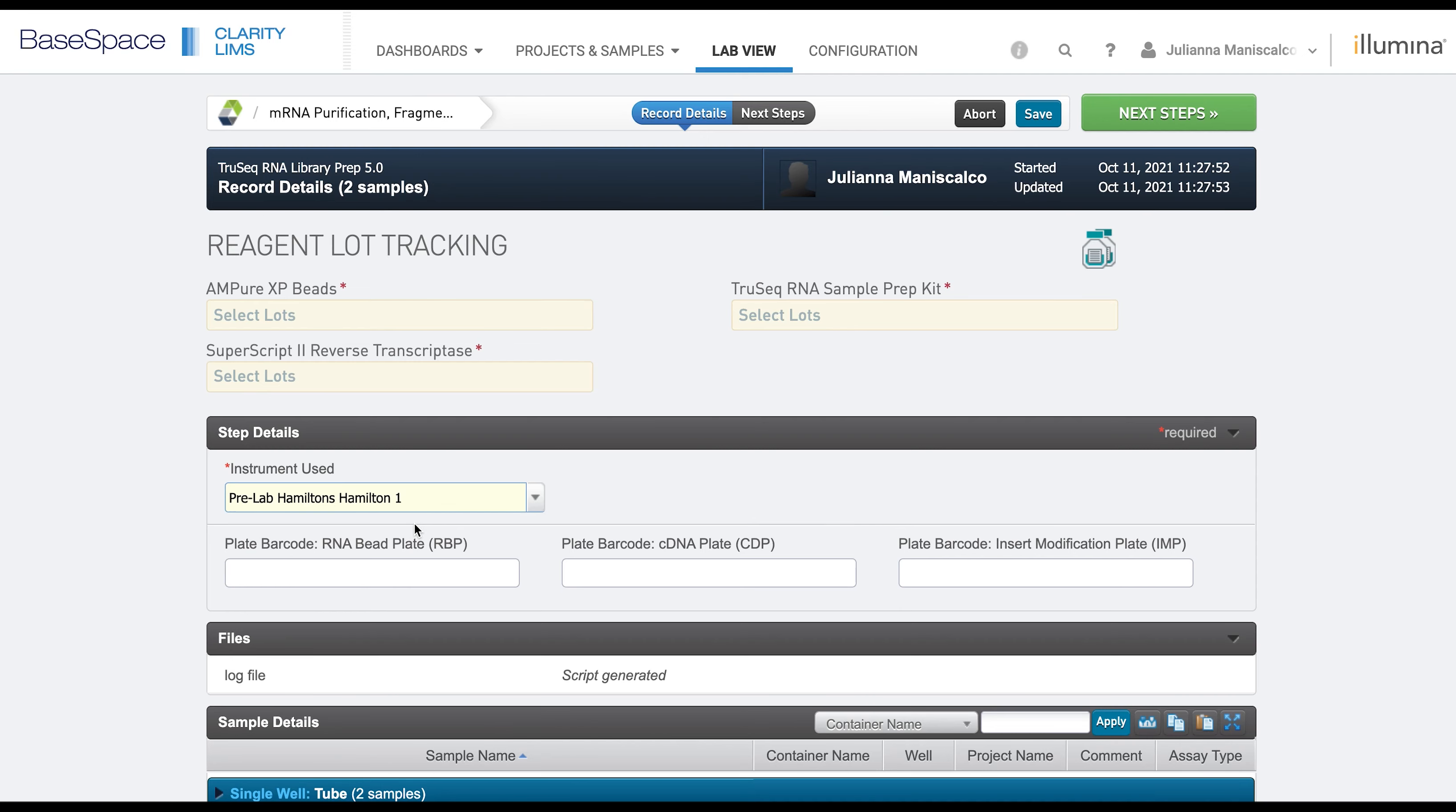The caveat to the instrument configuration is that you can only associate one instrument per step. So if you want to track a liquid handler and a thermocycler on one step, one could be configured as an instrument and one could be configured as a step custom field.